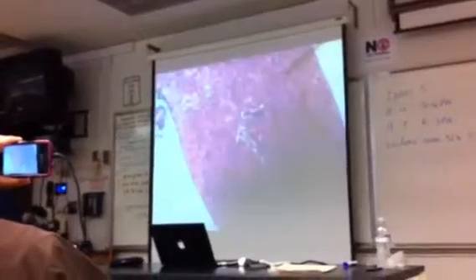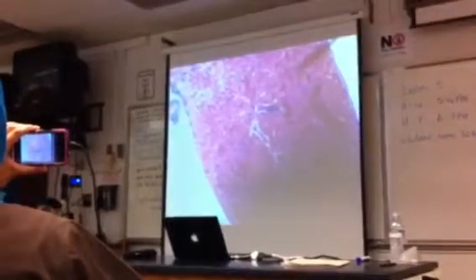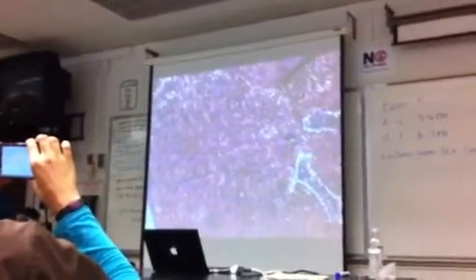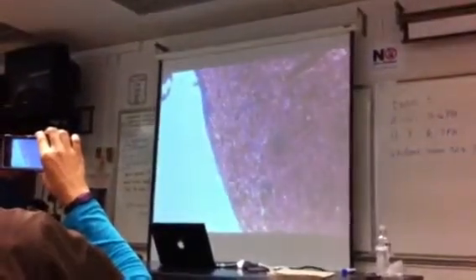Well, this is spleen. Red pulp and white pulp, well, they really can't make it out very well on this slide. So let me go a little higher power here, like medium power. Oh, this is just not good. Maybe this is a new spleen slide and I haven't seen it yet.